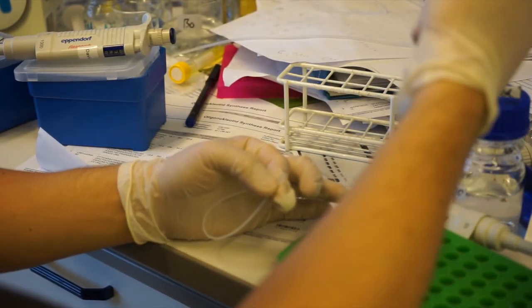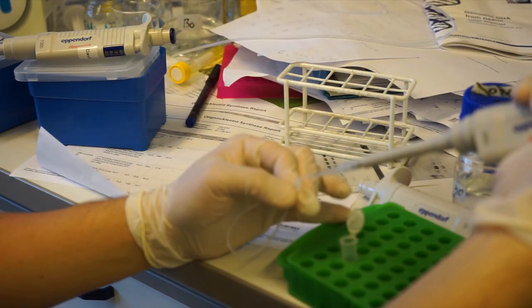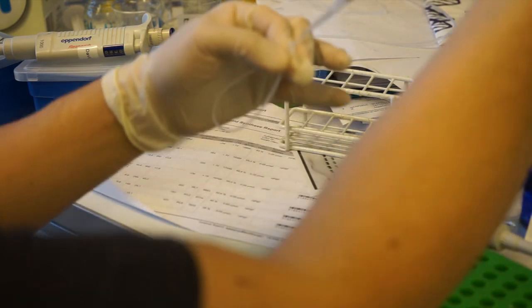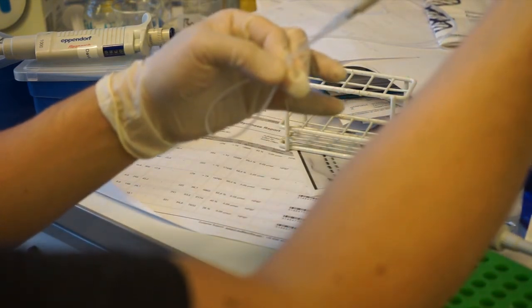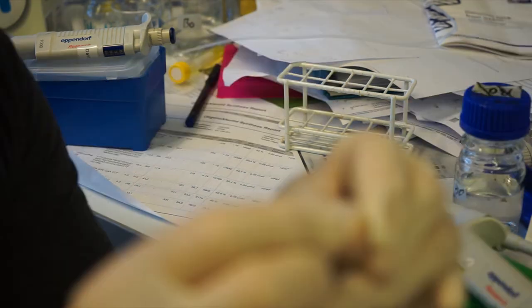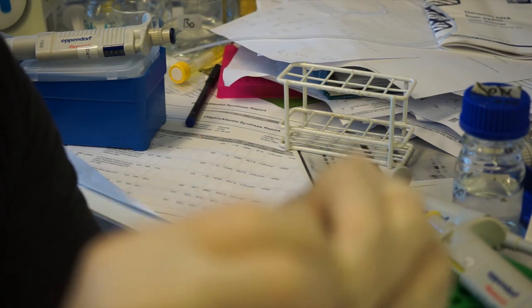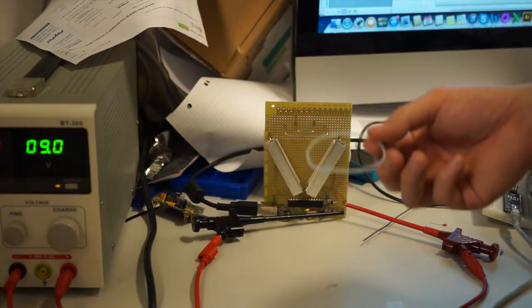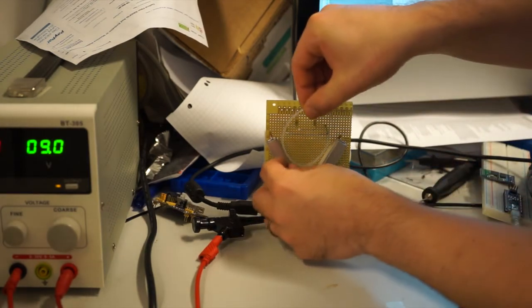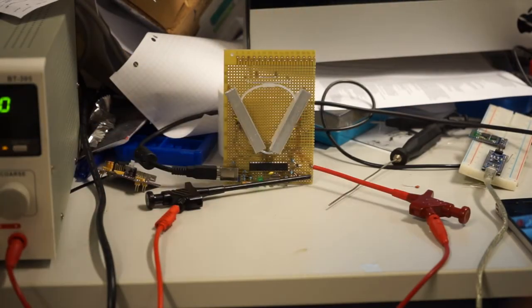You just take the PCR reaction mixture, stick the tip into the stretchy silicon tubing, and just squeeze it in until the reaction mixture is just starting to squirt out the top of the other tube. Use that droplet to push the ends together and not let a bubble get into the silicon tube ring. With our DNA sample now ready, we can mount it into the Polymerase chain reactor and then connect to the serial port. After half an hour, we can turn off our power supply and take our sample out.